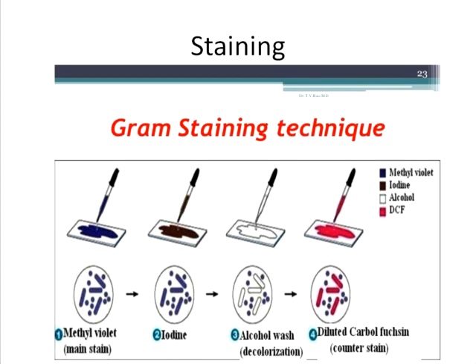The next reagent is Gram's iodine. When you use it, it helps to fix the violet colored dye, that is methyl violet, onto the cell wall of bacteria. Now, if you were to peep into the microscope at this stage, all the organisms, all the bacteria will appear violet in color because the cell wall has been fixed with this dye with the help of iodine. It is a fixative agent. We call it a mordanting agent.